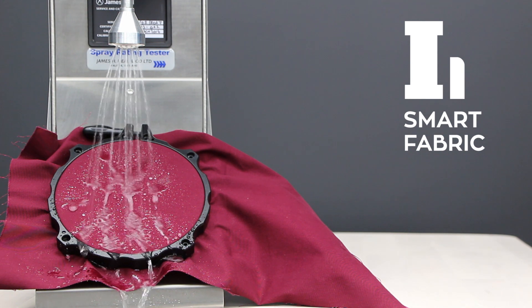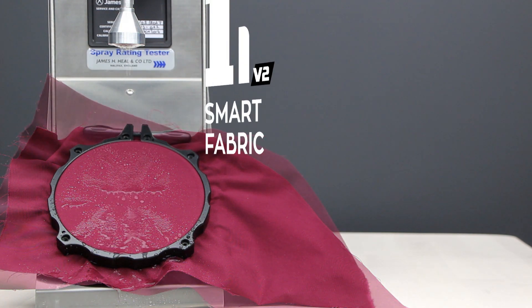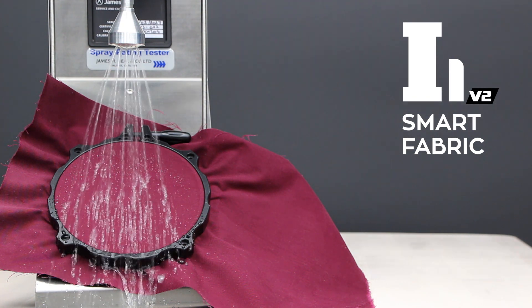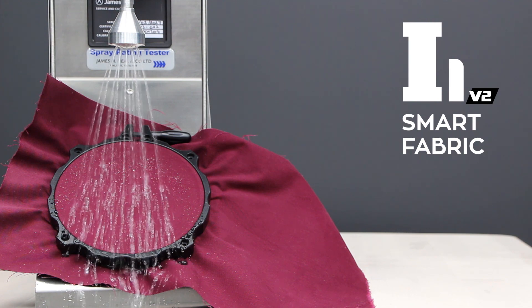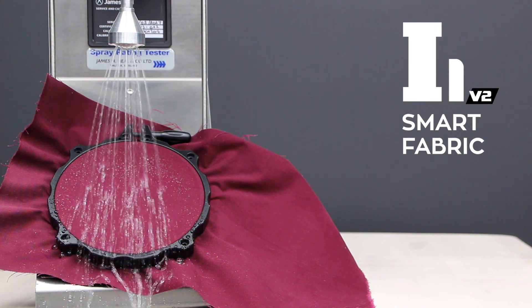This spray test measures the water repellent efficiency of fabric. Water is sprayed against the taut surface of a test specimen and under controlled conditions produces a wetted pattern, the size of which depends on the repellency of the fabric. Evaluation is accomplished by comparing the wetted pattern with illustrations on a standard chart.